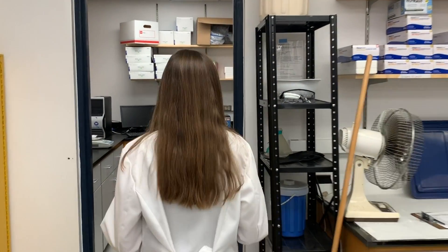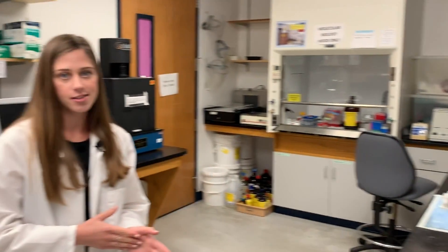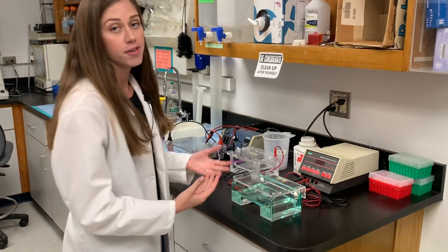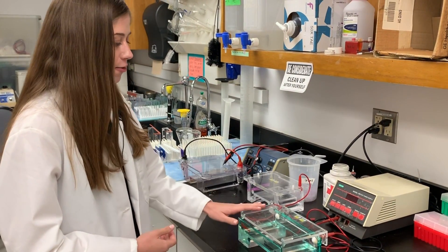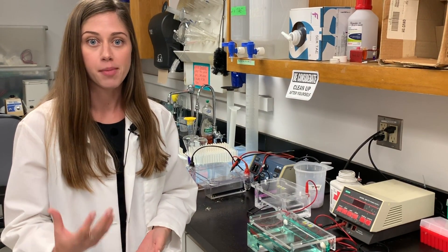And then if you come this way, this is our gel imaging room. Being molecular biologists and working with such small molecules, we use something called a gel in order to visualize what we're working with. We make them and run them in these different apparatus and we use stains in order to visualize the molecules that we're seeing.